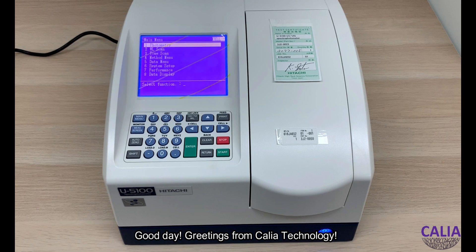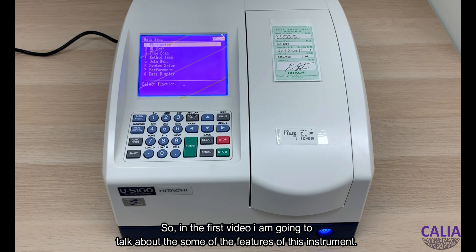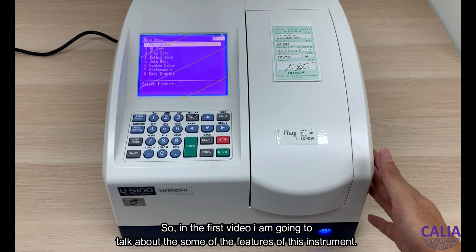Good day! Greetings from KLEAR Technology. My name is Jesper and today I'm going to introduce you to our Hitachi U5100 ratio beam UV-Vis spectrophotometer. In this video, I'm going to talk about some of the external features of this instrument.